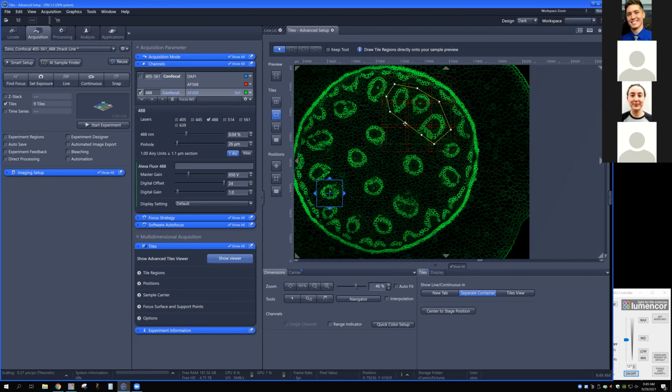So this gives you a lot of flexibility to work with just by doing the pen tool idea versus the pencil tool, okay? And that's basically it for this. It's very straightforward. These are the 3 or 4 tools that you have. You can keep this if you want to keep on doing regions like so. So it's very fast, I think, to set all of these different positions up. All right.